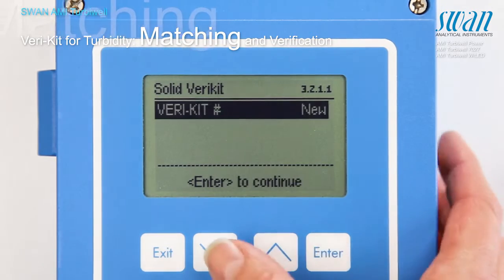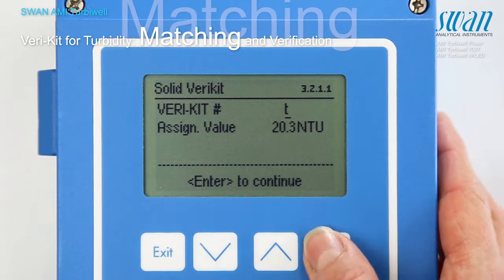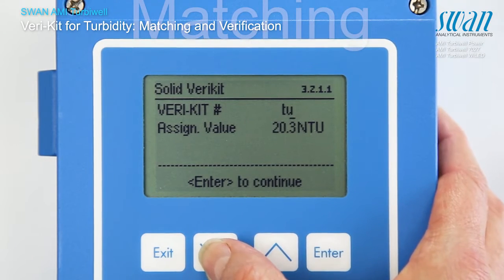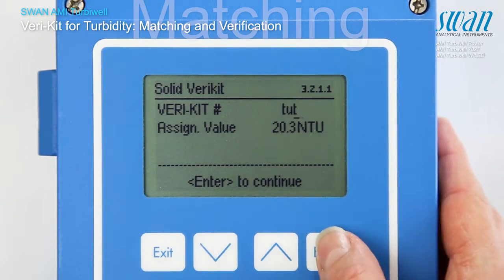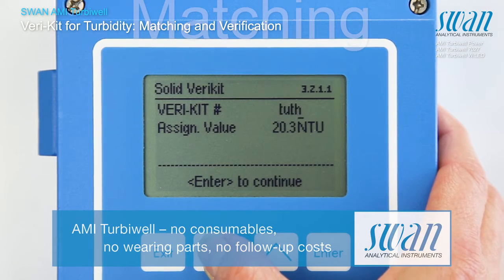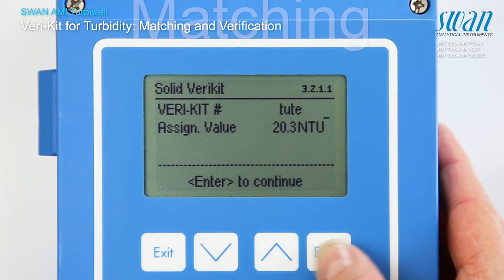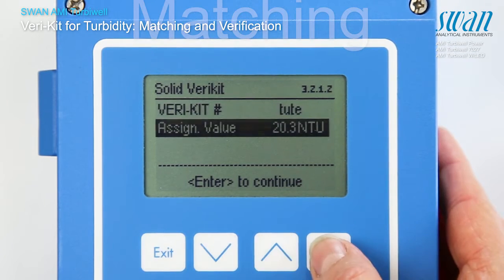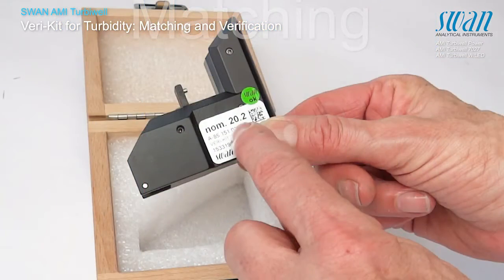In case a new varikit is to be matched, proceed as follows. Define a unique name for the varikit. There are 10 characters available. The assigned value is shown on the label of the varikit.